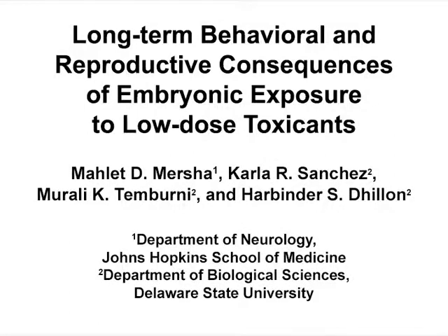The overall goal of these procedures is to investigate the long-term effects of low-dose BPA exposure in early embryogenesis. C. elegans embryos are exposed to BPA for a limited period and tested upon reaching adulthood for fecundity and learning behavior.